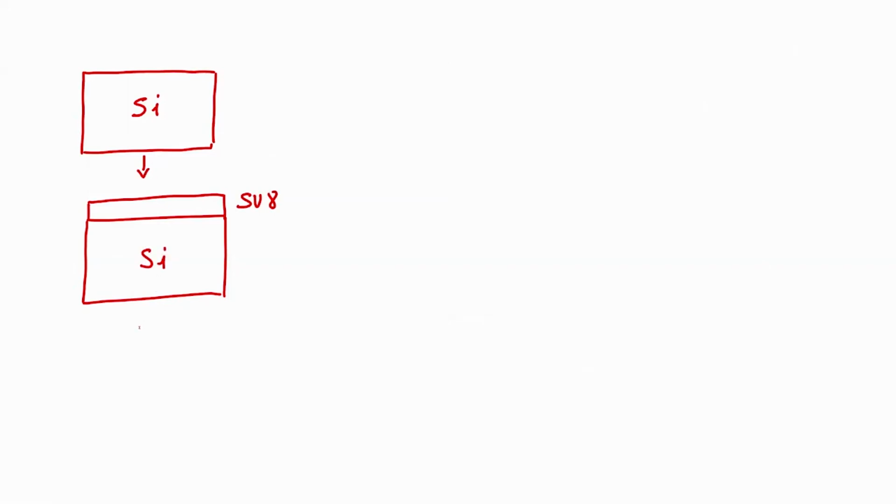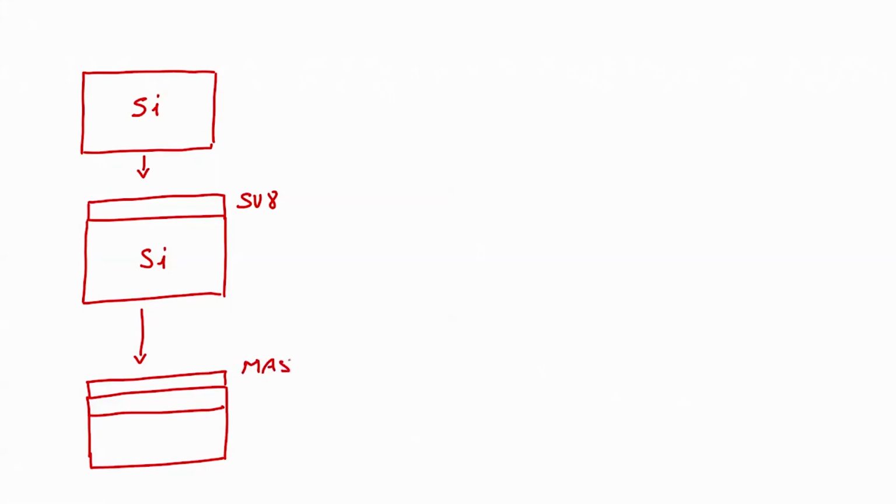on silicon. Third point is you load mask on SU8, right, and SU8 is which kind of photoresist?